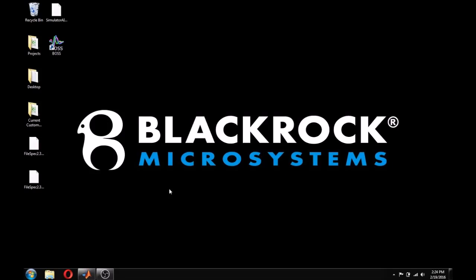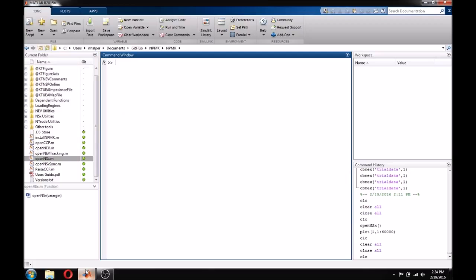MATLAB is a powerful tool for many researchers. This video series covers the basics of working with our Neural Processing MATLAB Kit, or NPMK for short. If you don't have the NPMK yet, you can download it from the download section of our website, or on GitHub under NPMK. The NPMK is primarily used for loading BlackRock data into MATLAB, but it has many additional functions for manipulating BlackRock data and data files.